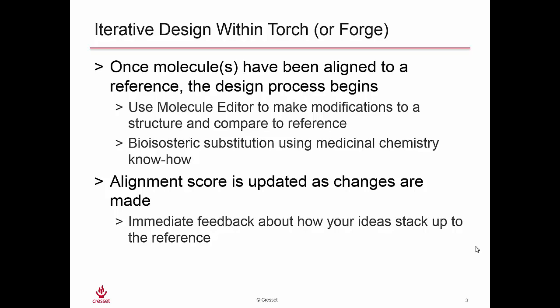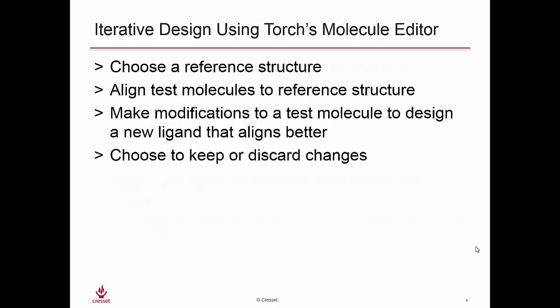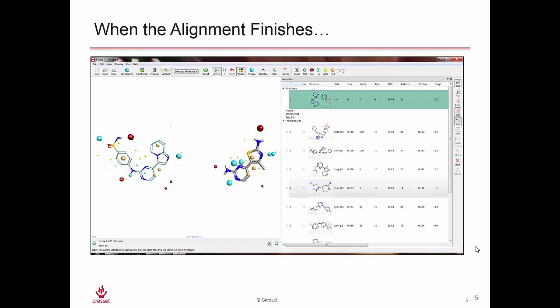This gives you immediate feedback about how your ideas, your design ideas, stack up to the reference. So this is on-the-fly design. Using the Torch molecule editor, we choose the reference structure, we align test molecules to the reference structure, we make modifications to a test molecule to design a new ligand, and then we can choose to keep or discard changes at every step of our design process.